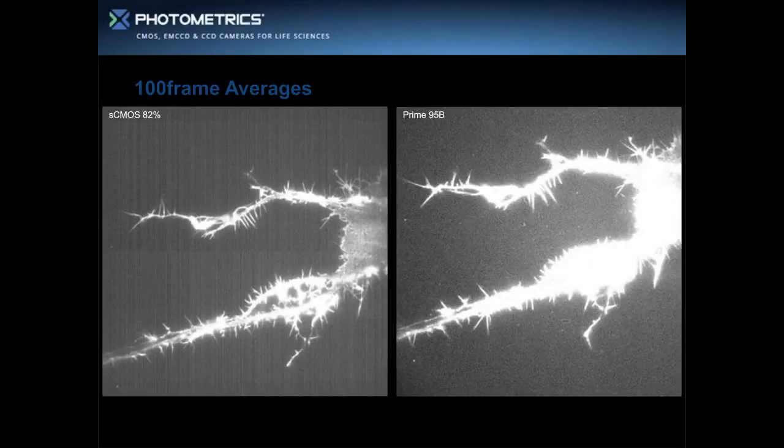One of the consistent complaints that comes up when using CMOS technology is that this pattern becomes visible, either with averaging or at specific light levels. I'm not exactly sure why, but this process with the back thinned sensor, however the pixel is designed and the structure behind it, gives you very clean images. I actually scaled this image much more aggressively than I did the front illuminated CMOS, and I don't really see any pattern in the background. What people have always seemed to request is CCD-like image quality from a CMOS sensor, and this newer technology seems to deliver that.